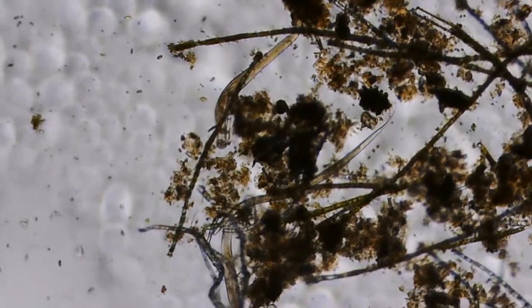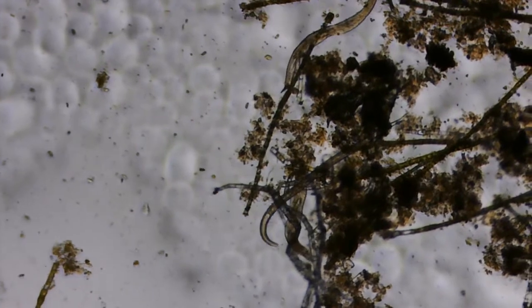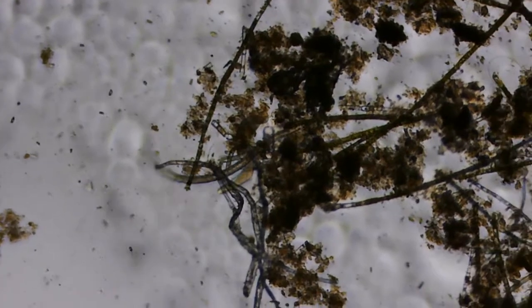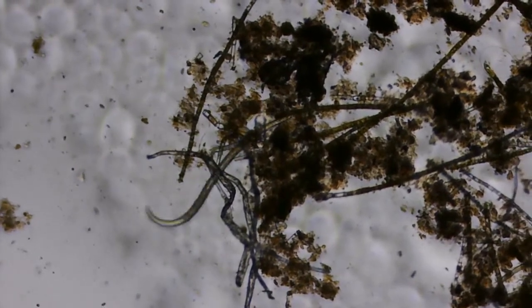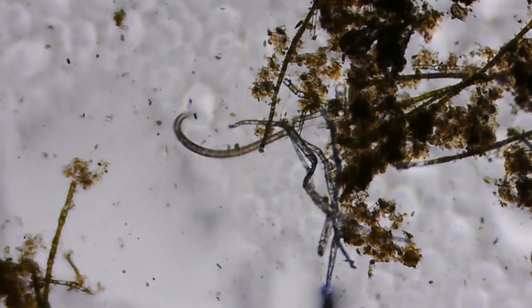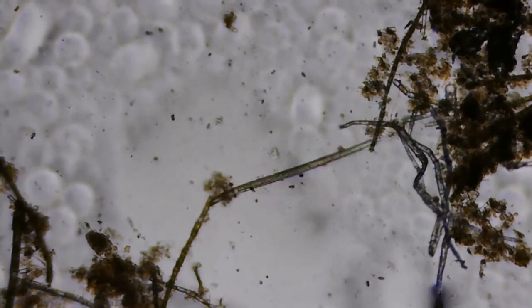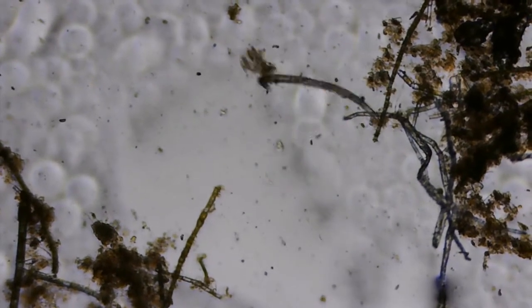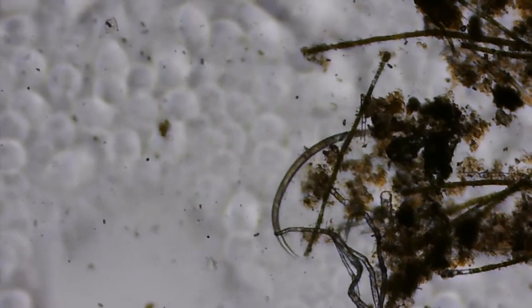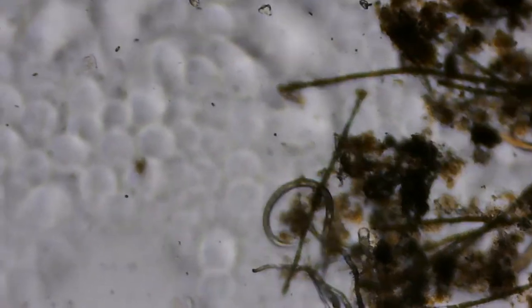What are we seeing? We've got that Spirostomum there. And the nematode seems to be coming out of the forest. Now the blunt end of a nematode is its head. The other end is often sharper, but that's not to say that it can't spear things with its head, which will often contain teeth or cilia on the end of it. And if you look at what it's doing to those other microorganisms, it might even be feeding on some of them. It's very difficult to tell without magnified footage, but it's gone after the algae there and it's hooked it. You can really see there how effective that hook is. It's not done very well at eating it though, I have to say.